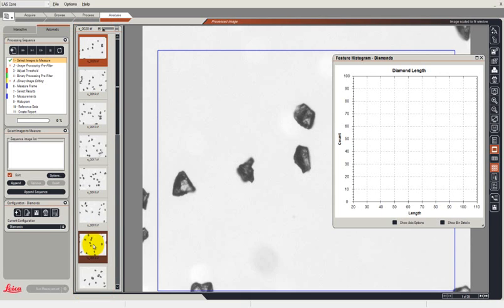So I'm going to have to load each image in automatically, perform the measurements and create the histograms. And at the end of this we'll see that we automatically can create a report in Excel.